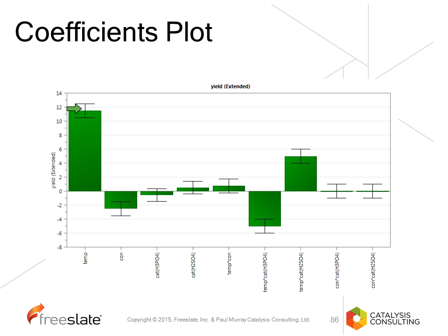In this case, we have the concentration. The concentration has a negative effect. So what that's saying is temperature has a very positive effect on the yield or conversion, whereas concentration has a negative effect. So at higher concentration, we get lower yield.